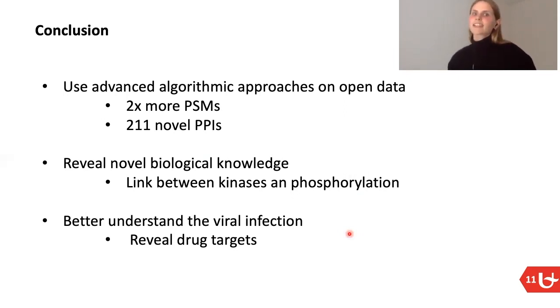During this presentation, I only presented an example from our investigation of the phosphorylation of SARS-CoV-2 proteins. However, we also investigated the effect of ubiquitination and S-nitrosylation to gain insights into how SARS-CoV-2 hijacks the cell.